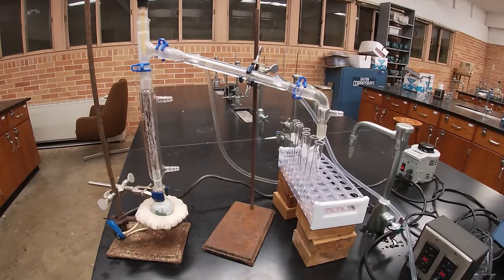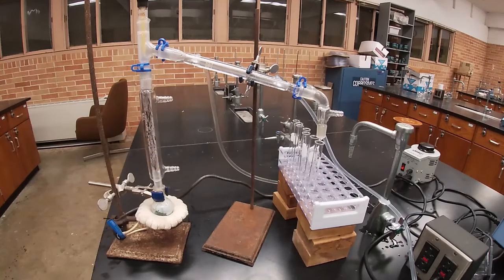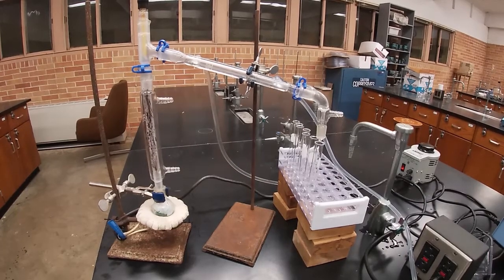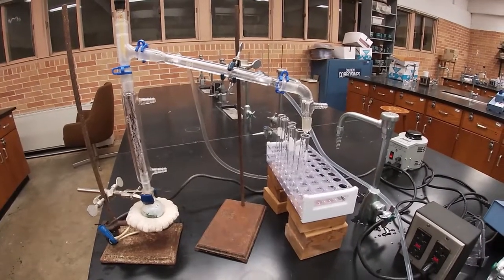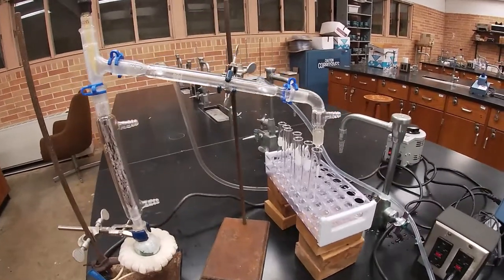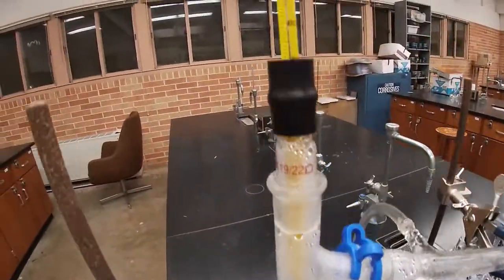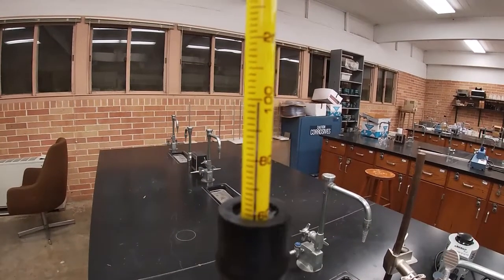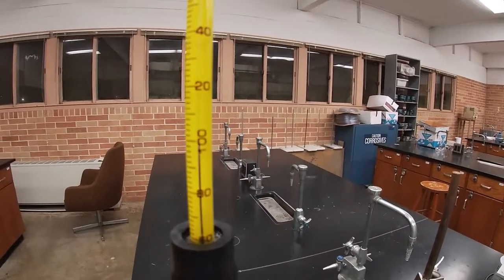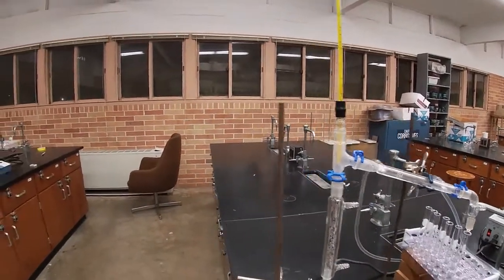Okay, so I've been collecting the fractions in my little manual fraction collector, and I didn't have enough test tubes, so basically I was doing 2 mils per test tube, and estimating when I got the first mil, and again recording the temperature. But we are pretty much exhausted now. There's nothing but water coming over, and we know that because the temperature is 100 degrees. Okay, so my temperature is 100 degrees. I'm at 15 mils right now.